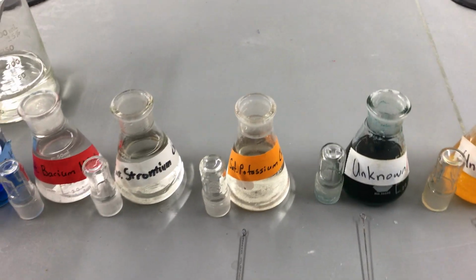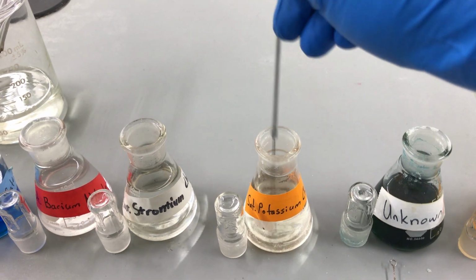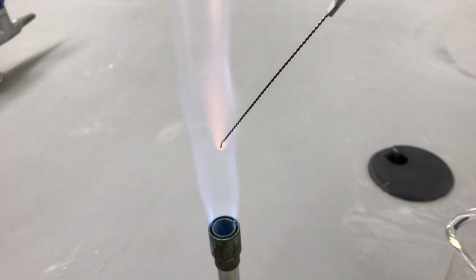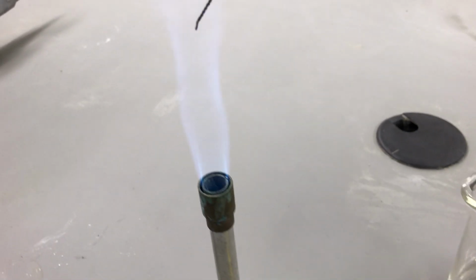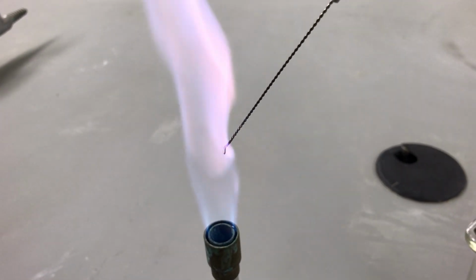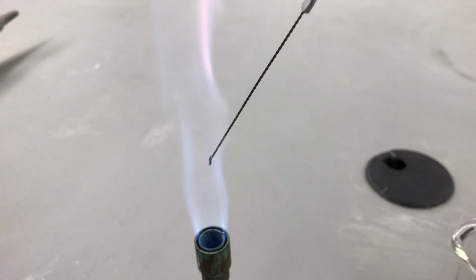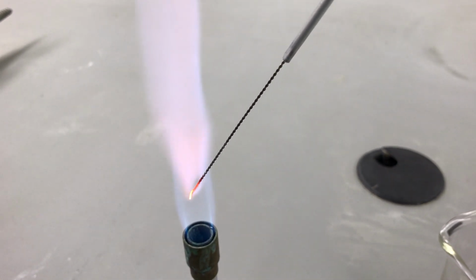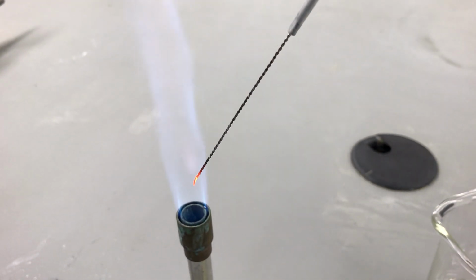Next up we have our potassium. This is one of my favorites. So we'll add in the potassium a bit. If you look, that's almost like a beautiful lavender purple. Let's try that again. So once again, purple lavender color, very pretty. And if you recognize these colors, it's because they use these same elements to make all the colors in the fireworks we see on the 4th of July. So it's a nice purple color to that one.